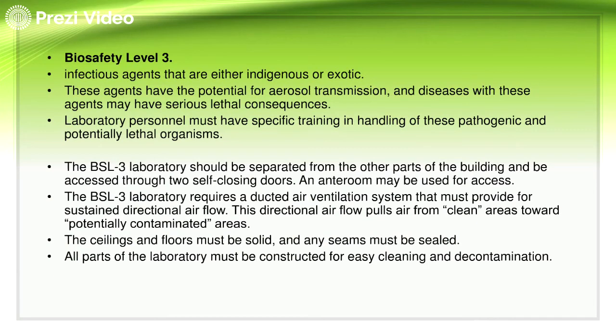For the biosafety level 3 naman, again, the infectious agents are indigenous or exotic. So, pwede mo siya makuha through aerosol. Okay? And they are very lethal ang mga sakit na pwede mo makuha sa biosafety level 3. So, kapag biosafety level 3 na laboratory, dapat separate siya from other parts of the building and can be accessed through two self-closing doors. An anteroom may be used for access.